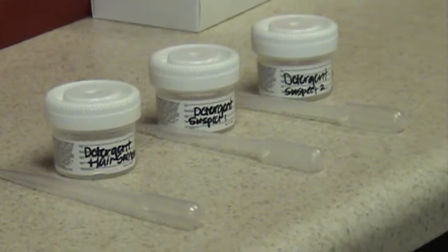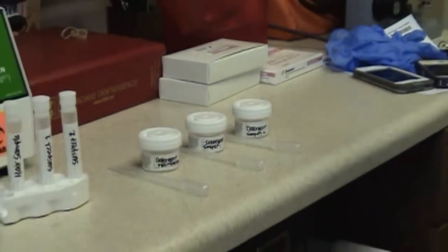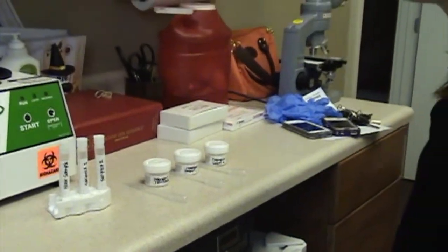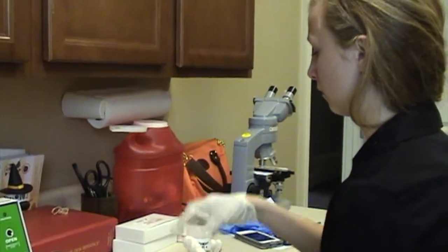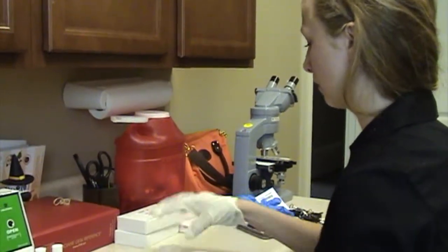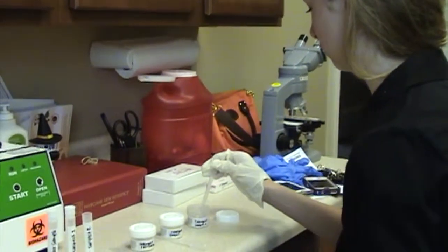After a few hours, the cells have dissolved, leaving the DNA behind. I will now take the DNA and place it into its own test tubes. Suspect 2.